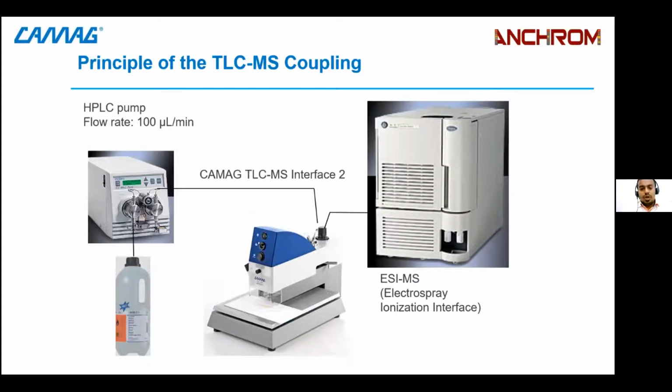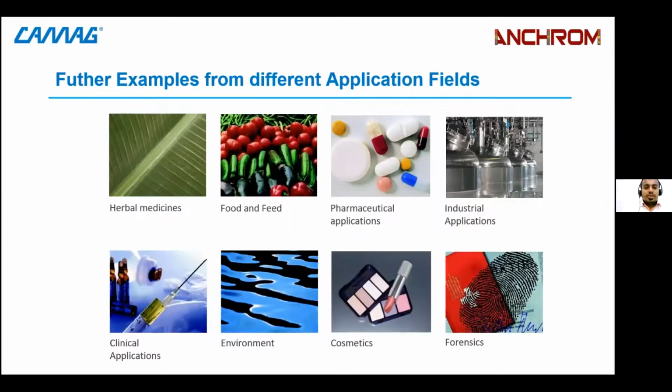So there is no harm, means the silica will not interfere in the MS part. So now the application of HPTLC.